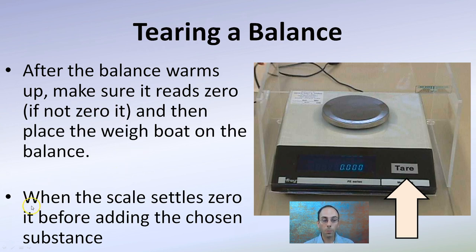Then place the weigh boat on the balance. When the scale settles, before adding your chosen substance, you tear it — put your weigh boat, which is a little plastic dish, on the balance, then press tare, and that causes it to read zero. Even though there's something on the balance, you get it to read zero so you can easily know exactly how much of whatever substance you're adding to that container. With more precise balances, they are typically enclosed in a plastic case to eliminate air currents that can make it difficult to get a consistent reading.